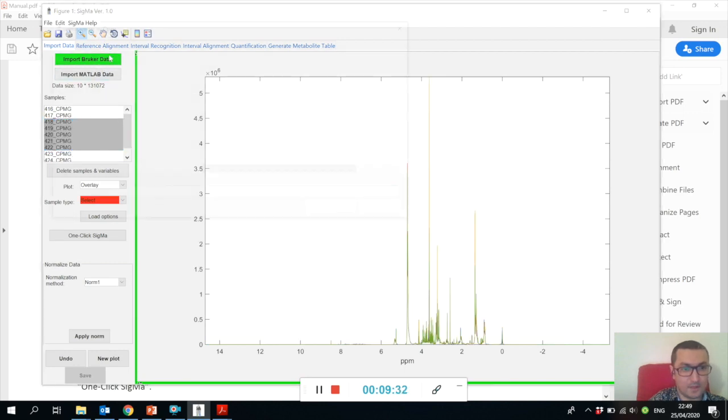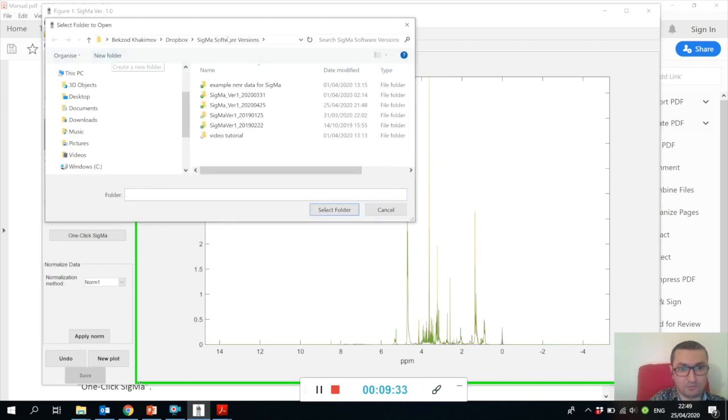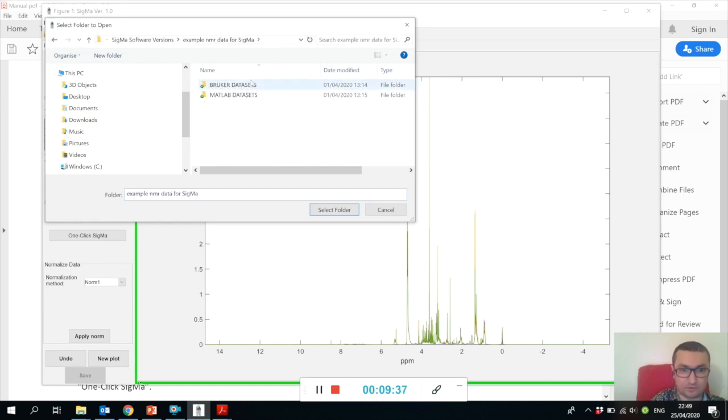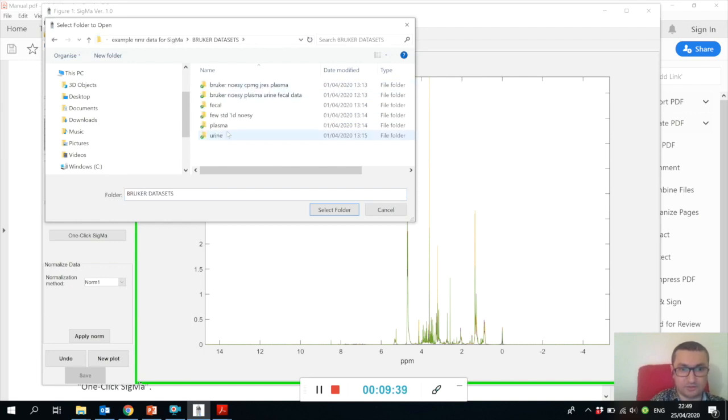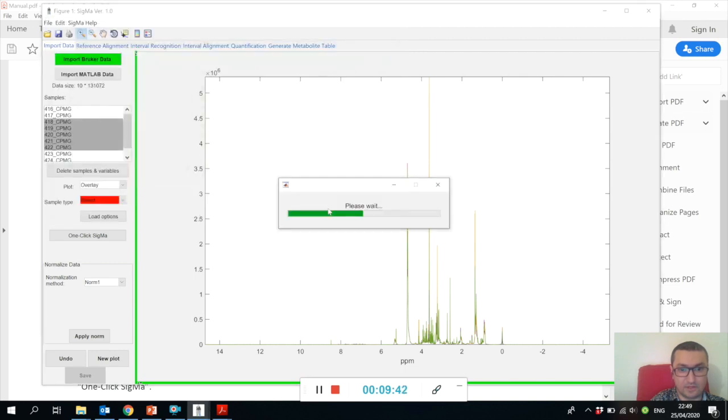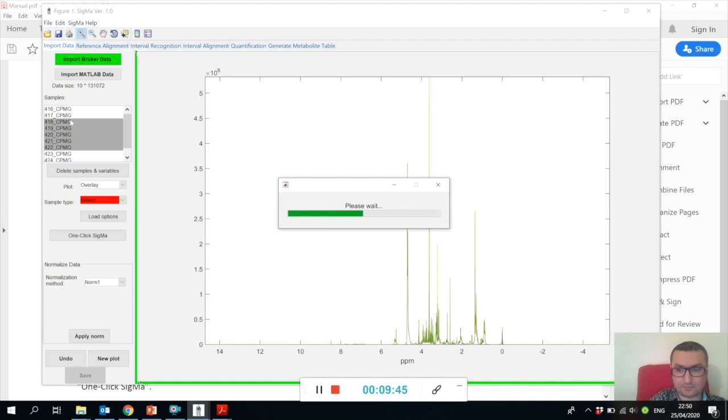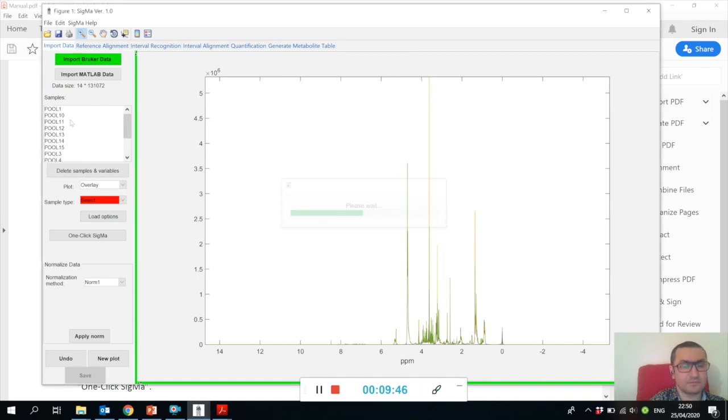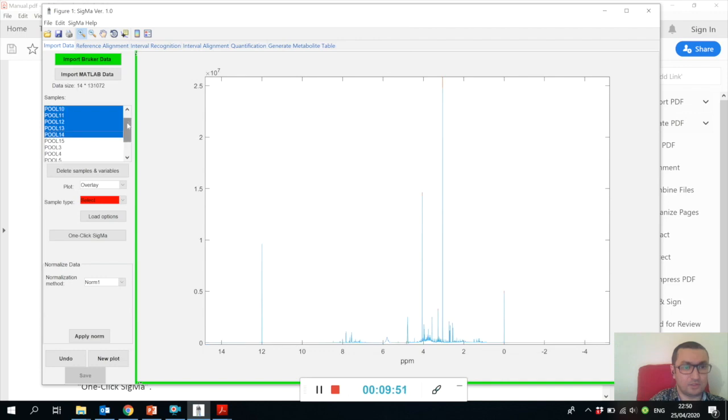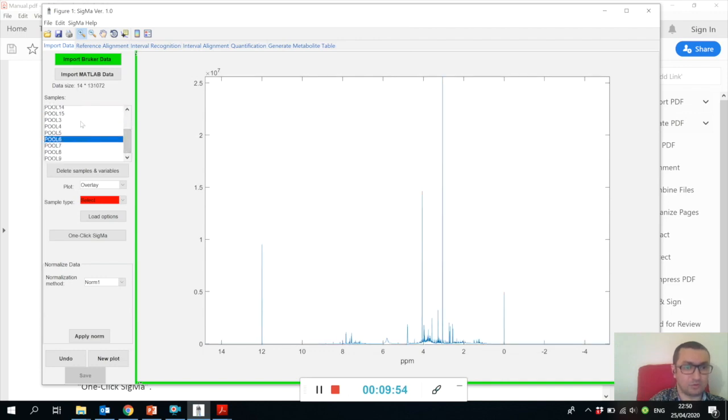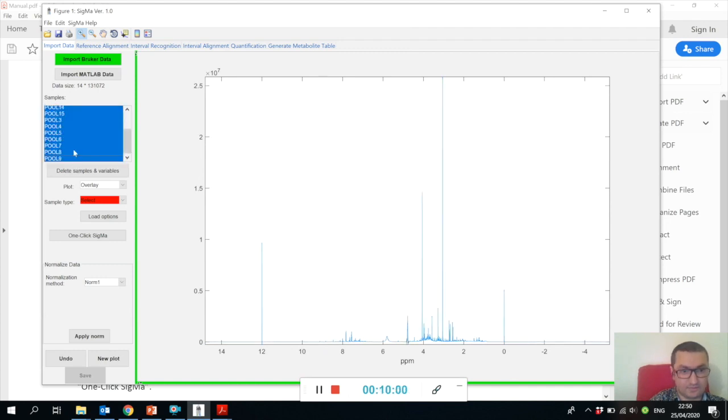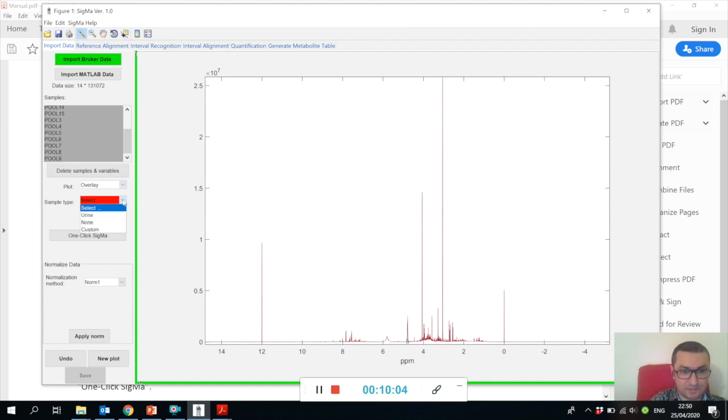Let me open our urine spectra because this version of Sigma actually works only with urine. Here we have again our 14 human pooled control urine NMR spectra.